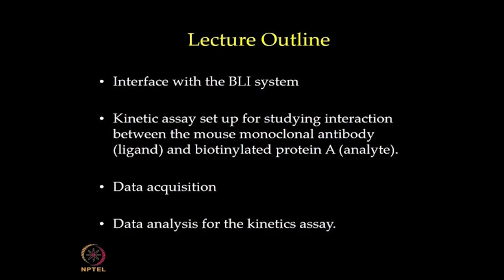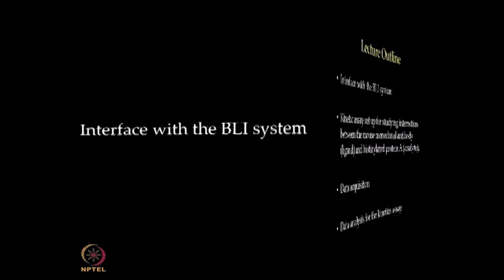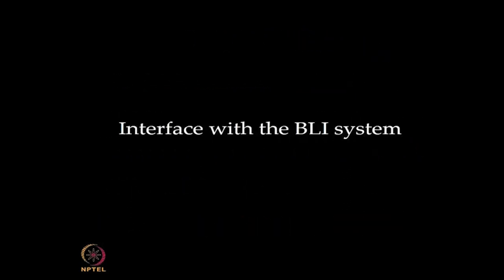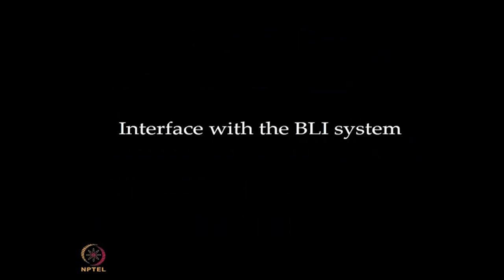Let us start the lab experimental session now. I am Sushilendra Vaidya, Application Specialist for FortiBio. Just now in the last talk, Dr. Shenglankov spoke about bio layer interferometry and its applications. Now I am going to demonstrate how this bio layer interferometry is done.